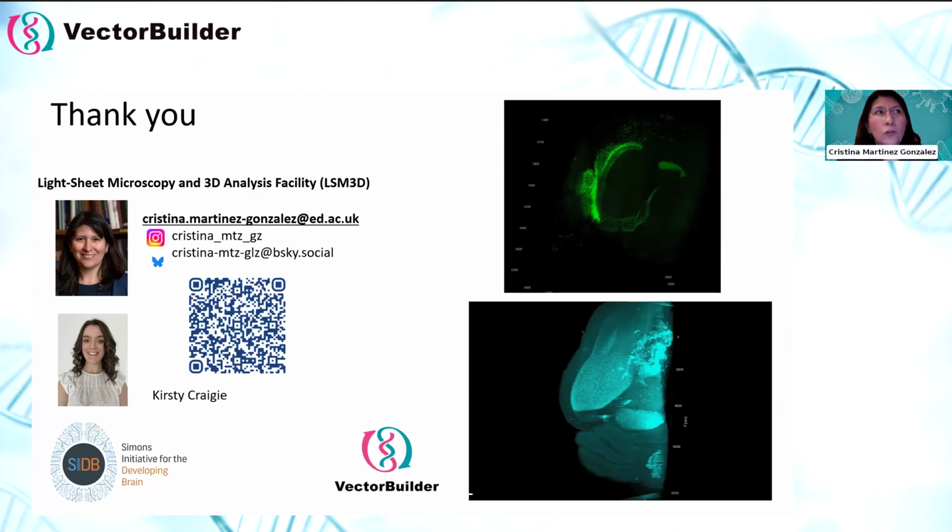Well, confocal is not suitable for solvent clearing generally because if you want the best image, you don't want to pass through air, which is a refractive index of 1, then through glass, then to the water solution, which is refractive index from 1.33 water to up to 1.46, which is the water-based approaches. So you're passing through all these different indexes, and obviously you will get distorted images.